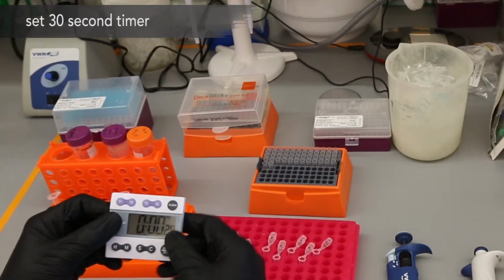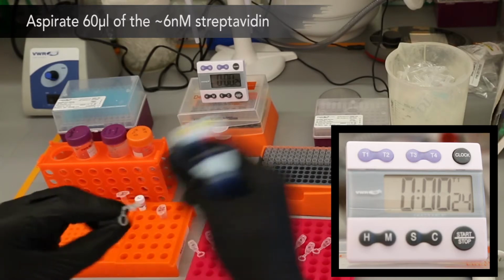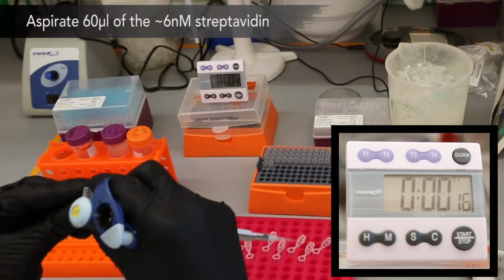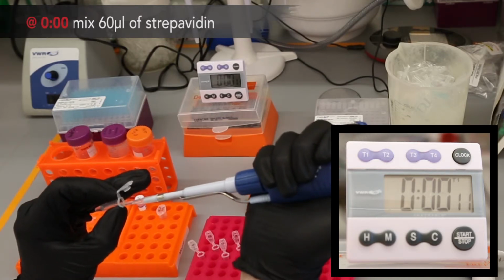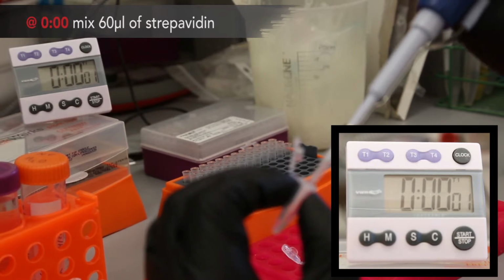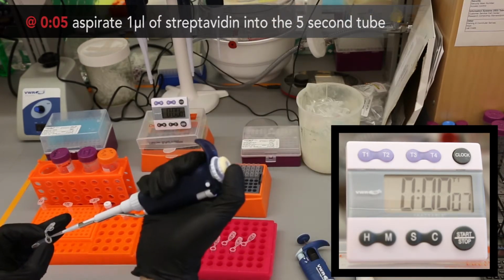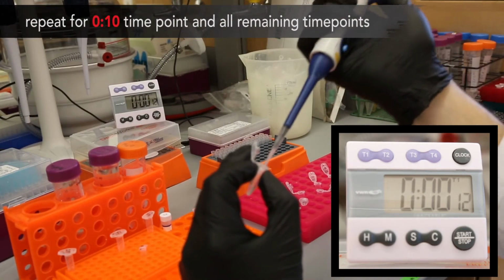Set a timer that counts up after the alarm rings for 30 seconds. Aspirate 60 microliters of the roughly 6 nanomolar streptavidin mixture into the pipette. Be sure not to handle the tube near the bottom, as this will heat the sample to your body temperature, yielding an artificially higher room temperature on rate. When the alarm sounds, mix 60 microliters of the streptavidin with 60 microliters of DNA. Grab the first 10 microliter pipetter and aspirate 10 microliters of the mixture. When the count-up timer hits 5 seconds, pipette the mixture into the bottom of the 5-second tube. Now continue with the remaining time points, changing tips between samples.